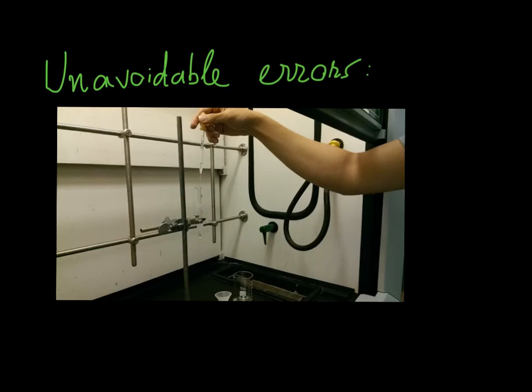One unavoidable mistake that I made in this lab was when I was using the pipette to agitate to mix the aqueous HCl and the ether layer together. Some of the acidic precipitate got stuck in the pipette and I could not get it out. So some of the solid was lost, and that made my percent recovery lower than I should have had.